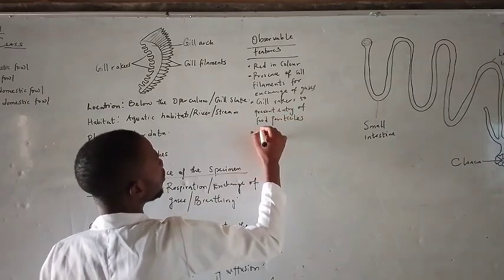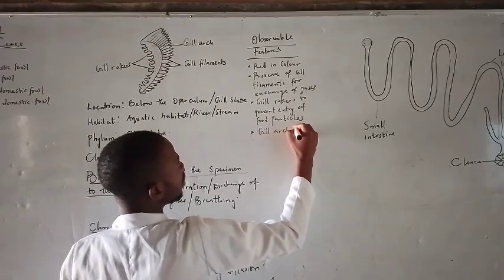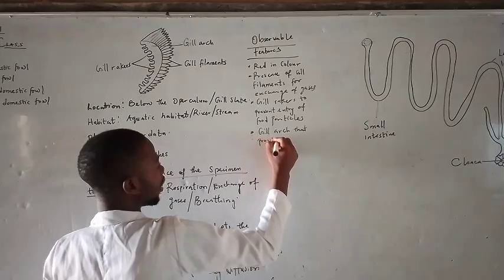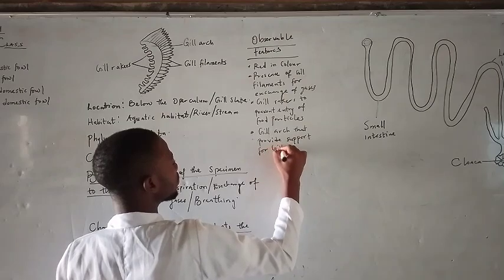You also have gill arch that provides support for gill filament.